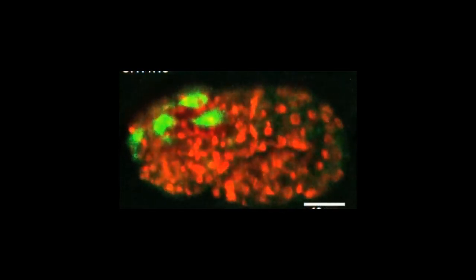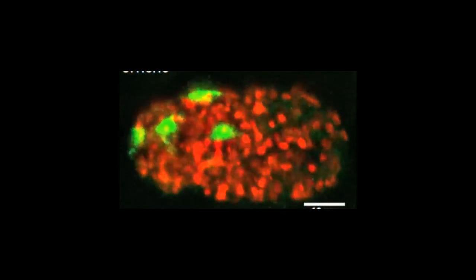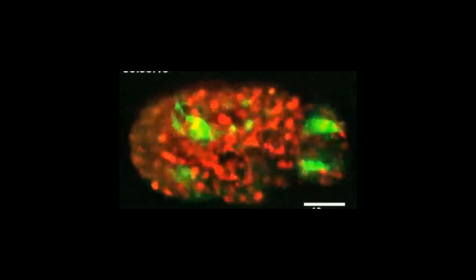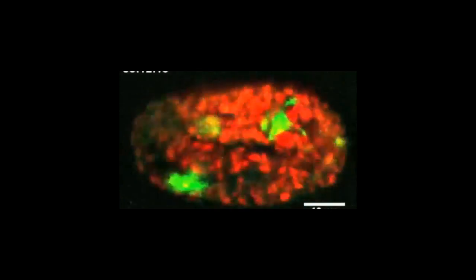Moreover, the speed of this microscope now allows us to see events that were never seen before. For example, in this embryo we can actually visualize the position of all cells. You can see the nuclei in red and then in green you're seeing the positions of neurons.